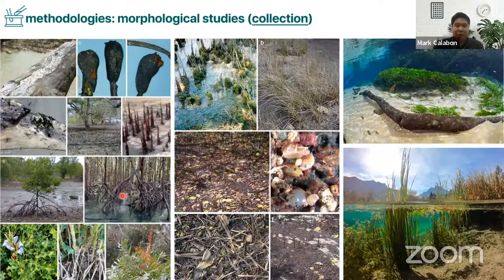We also isolate from salt marsh environments in Thailand and also from the UK. Sediments also. You can see here, this is a fruiting body of a fungus. And from the freshwater environment, we collect woods and grasses.